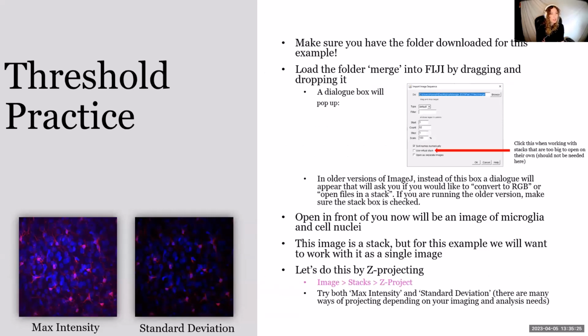I'm seeing, not sure how to open all pictures together. They open separately in 62 different pictures. That sounds super annoying. So did you take the folder and drag and drop it onto the Fiji bar? If you select all the pictures with a Control A and drag and drop those, that will open them all individually. You have to go up a level and take the whole folder and drag and drop it into Fiji. When you drag the whole folder, it doesn't want to do anything.